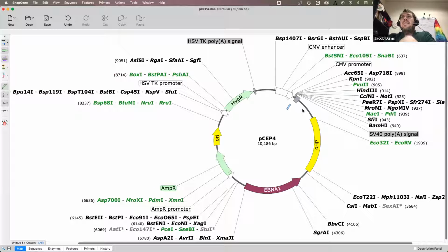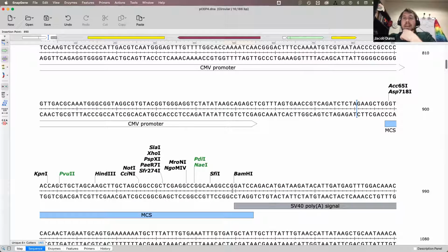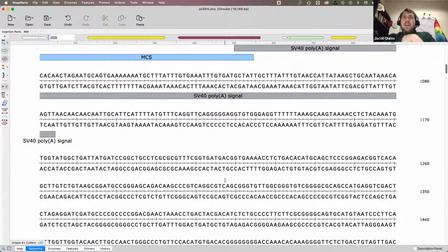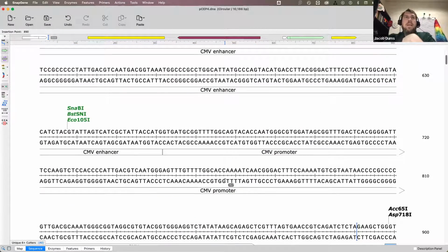And then the last thing that I think would be helpful for us to look at would be how to annotate something. So creating your own annotations or modifying established ones is really helpful. But it can be very nice to be able to add your own annotations for your own information.